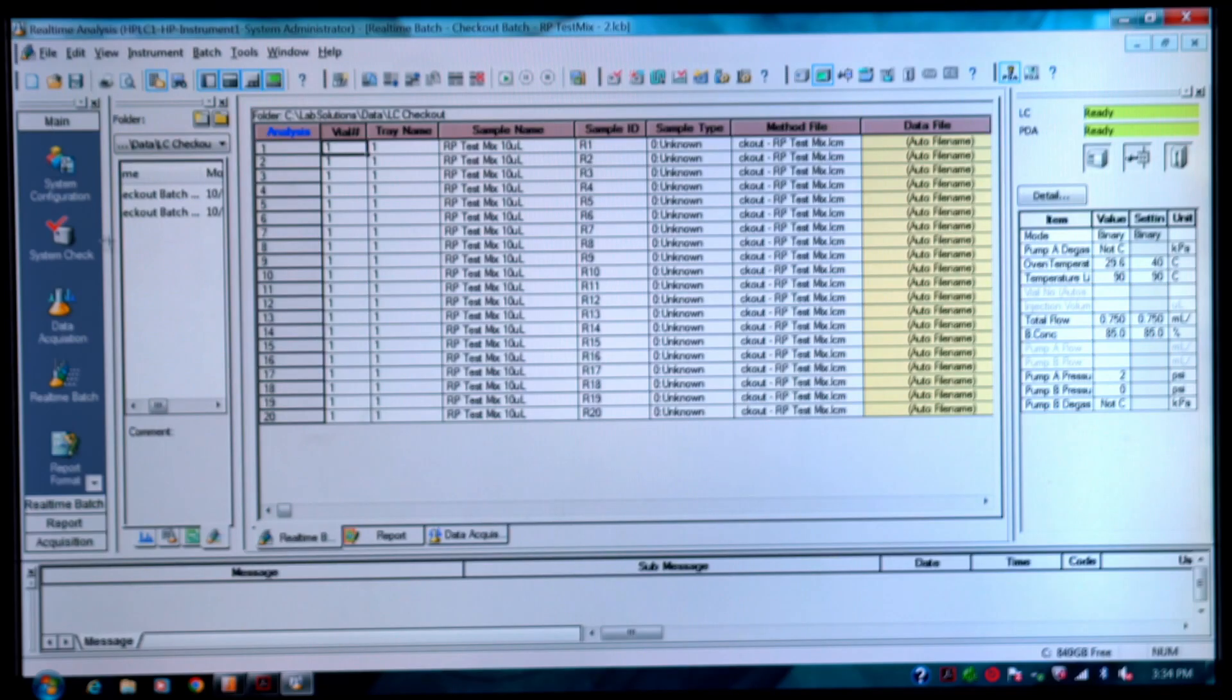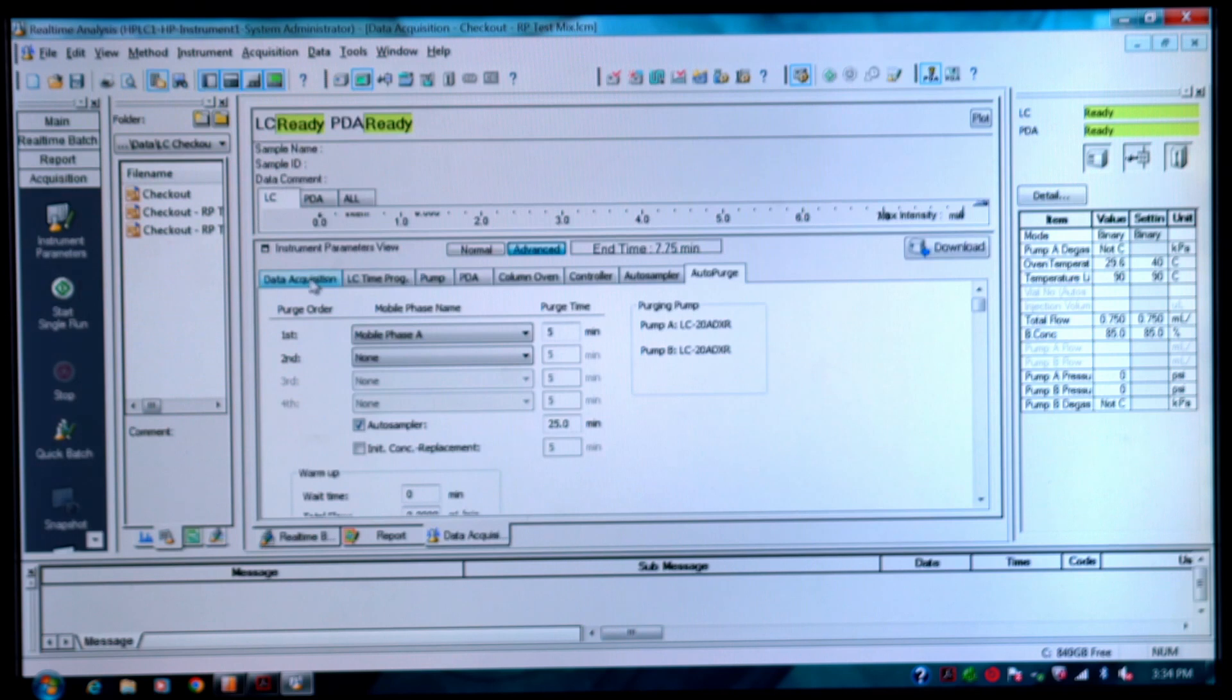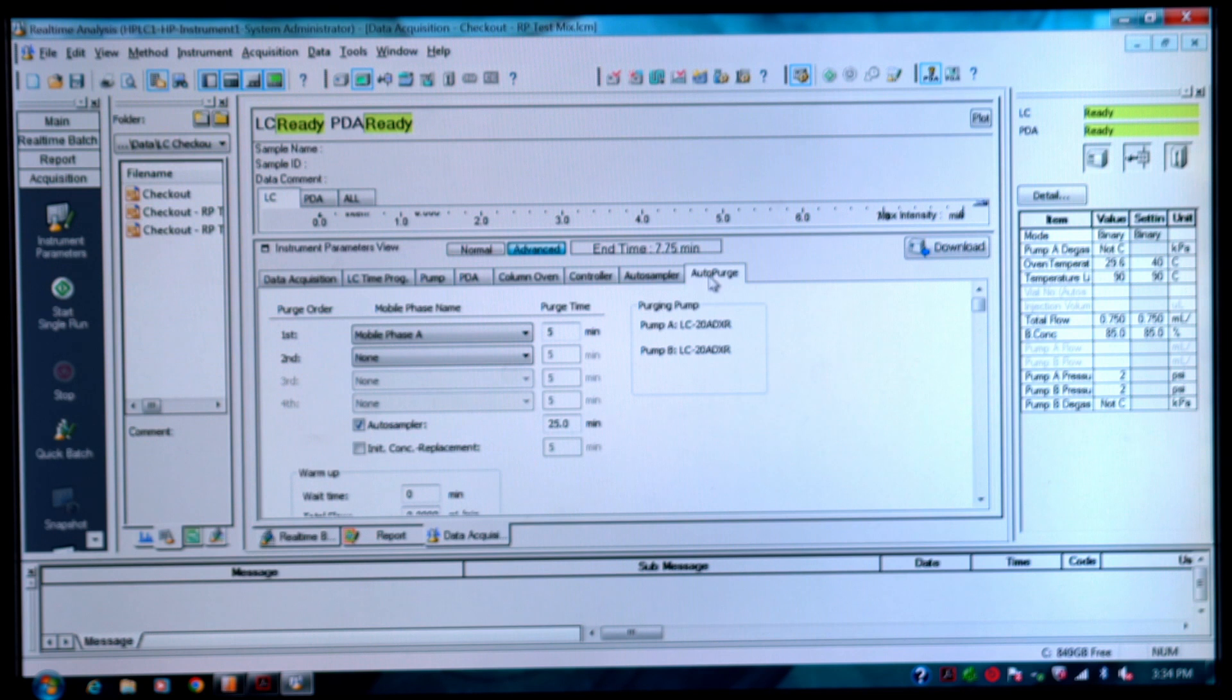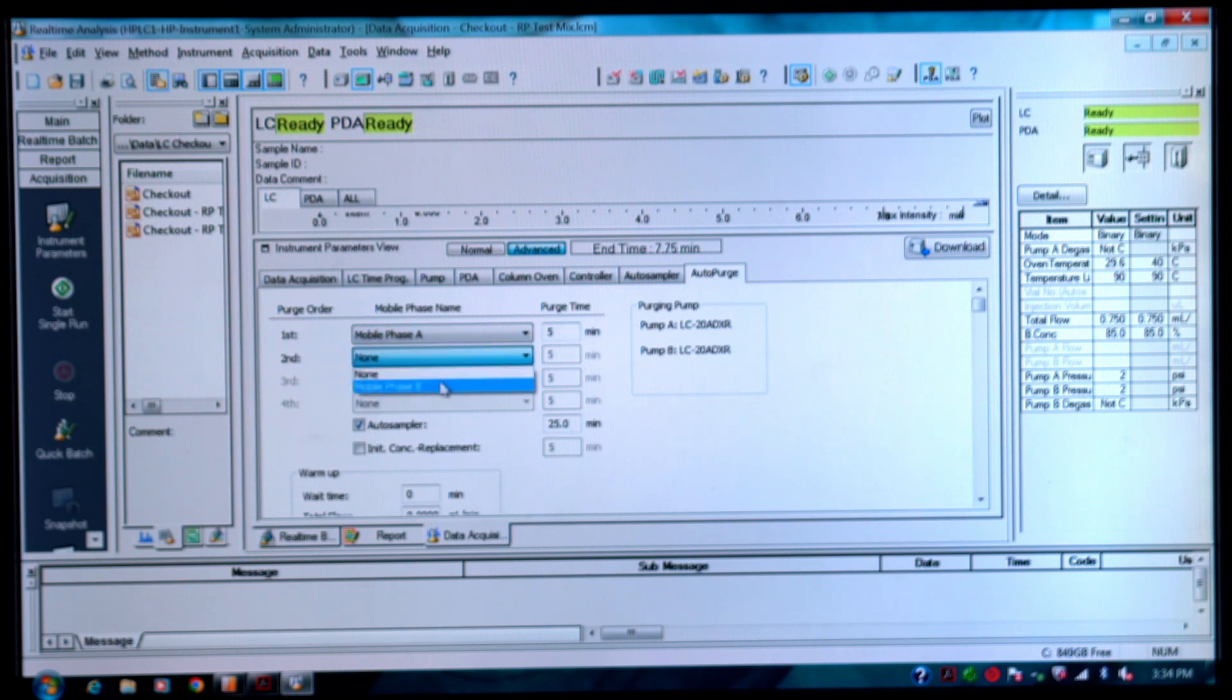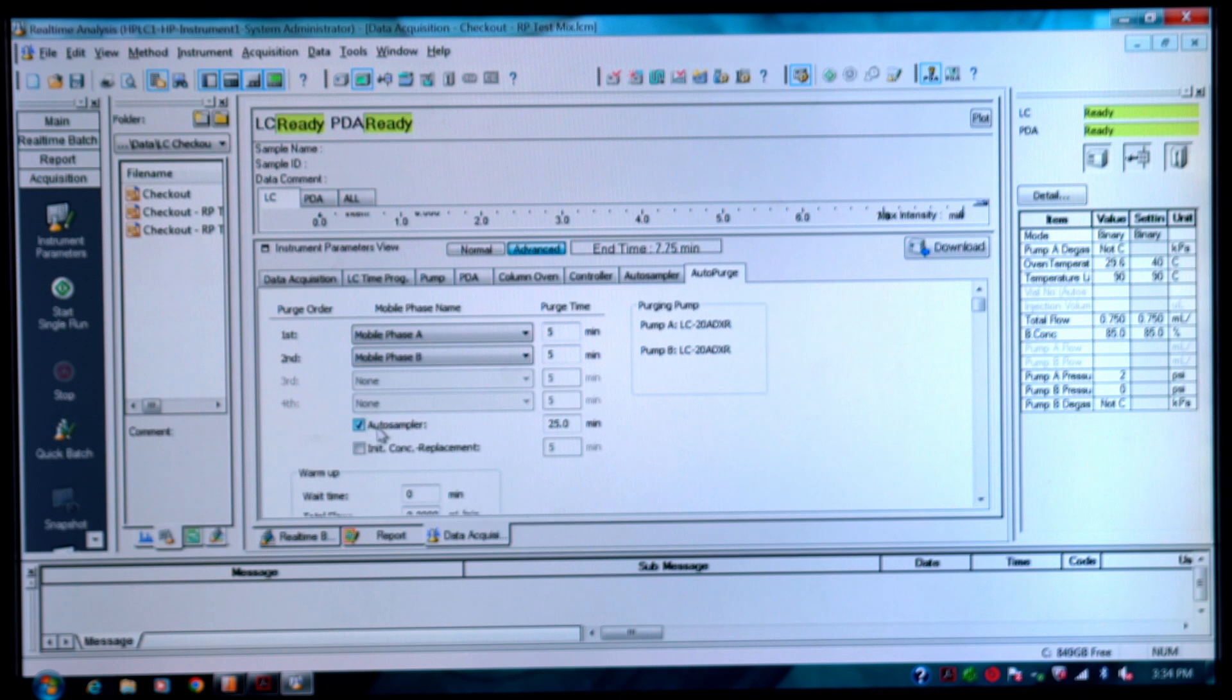Where you go to the purge setting is you go to data acquisition. The method parameters are up here. Where you want to go is this tab over here that says auto purge. Here you can specify which mobile phases you want to choose and how long the purge time should be. If you simply check this button then you can purge the autosampler as well.